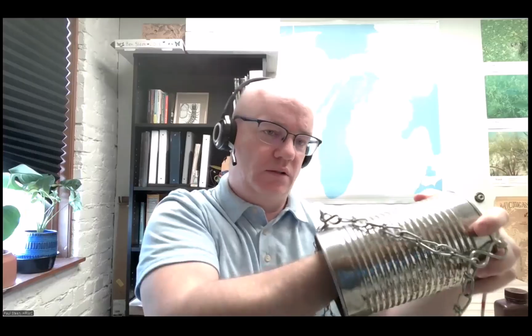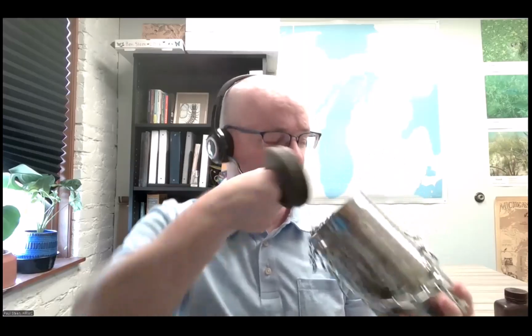Now, in your sampler itself, there are a couple of loose weights, and that is to prevent, well, when you drop this thing in the water, you just want this really quick, rapid descent down. So the weights help make that happen. So you have a nice drop. But notice they're loose. They're not glued in, because if we glued them in, we would never get this thing properly dried. So these are sitting in here loose, and you have to be careful you don't drop them overboard, because that happens.